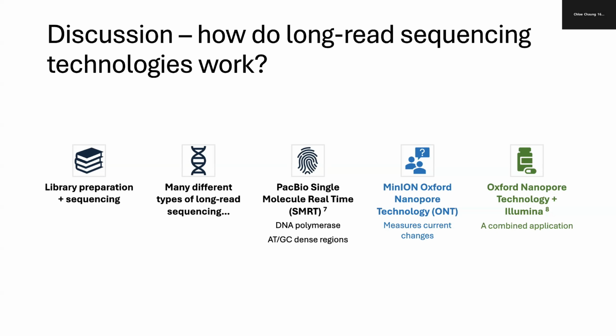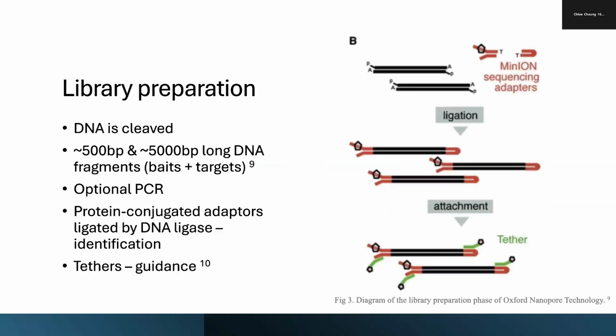In our case, Oxford Nanopore technology relies on changes in current of its pores when different bases go through them. Recall that short-read sequencing is limited because it takes a lot of time and is restricted to short fragments. Of course, Oxford Nanopore technology has its own limitations, which we'll cover later, but often short-read Illumina is combined with long-read Oxford Nanopore technology to holistically screen genomes.